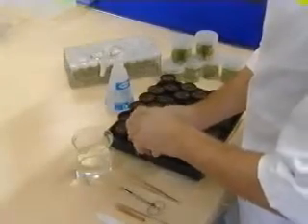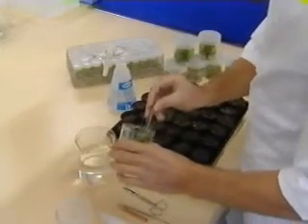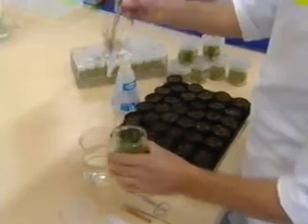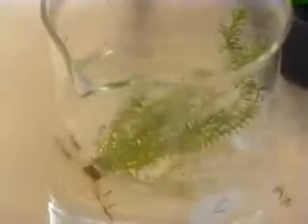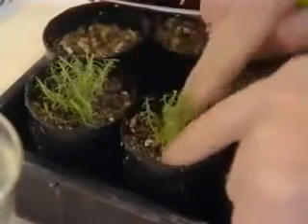Because of these reasons, the in vitro grown plantlets need to be introduced to the outside environment in a gradual manner. As a general rule, the plantlets are removed from the culture vessel in a room away from direct sunlight. The gelling agent is washed away completely to remove a potential source of contamination. The long roots and shoots are slightly trimmed, and the plants are then transferred into a suitable pasteurized potting mix.